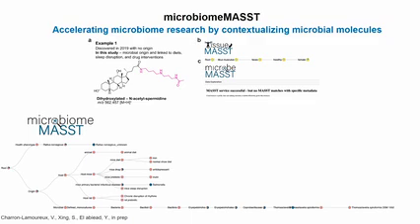But in the new interface that you're all going to have access to very soon, you have this new tree that we created, this new ontology that we curated. If you go to the bottom right, you have the origin, then a specific microbe, and we know which specific microbe is producing or conjugating N-acetylspermidine to this specific bile acid. Maybe these specific microbes are actually not in MicrobeMASST, right? It doesn't mean that because we don't have a hit here, the microbe cannot make it.